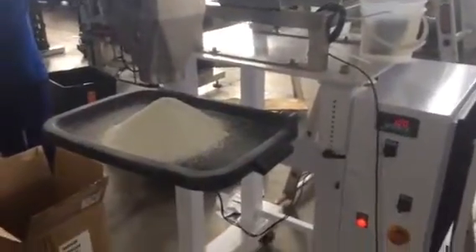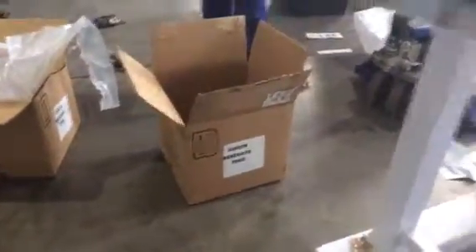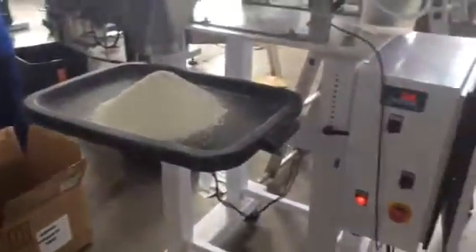This is trial number three for Coca-Cola Swaziland, and this time we're using Sodium Benzoate. The first one we've done — you can see there — we have exactly one kilogram.